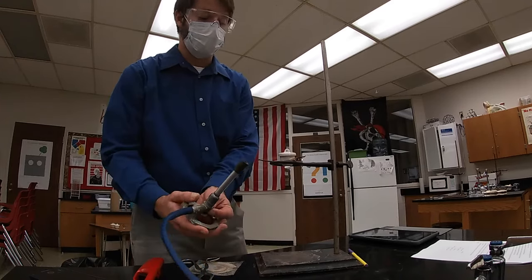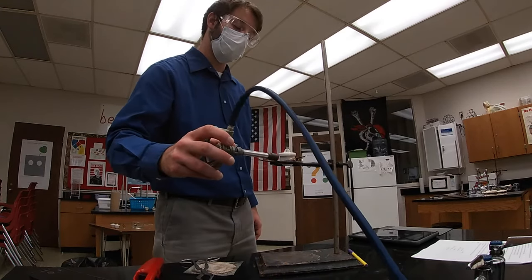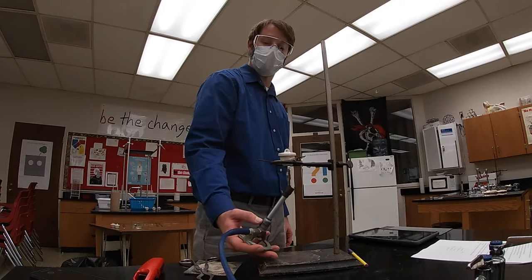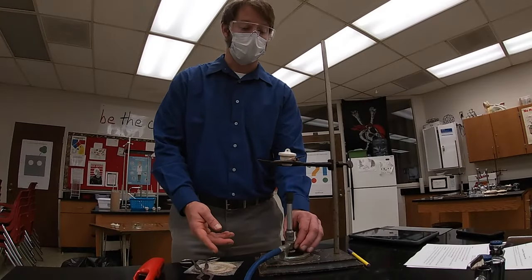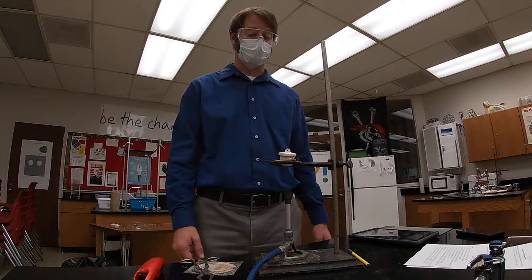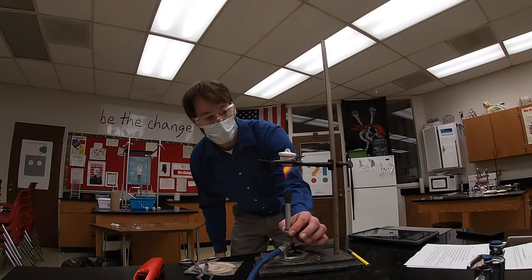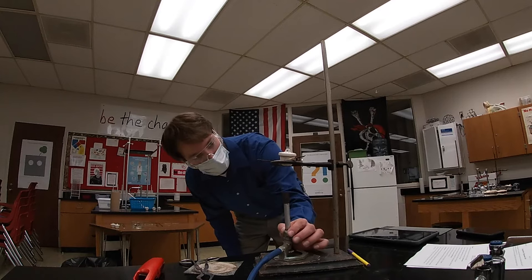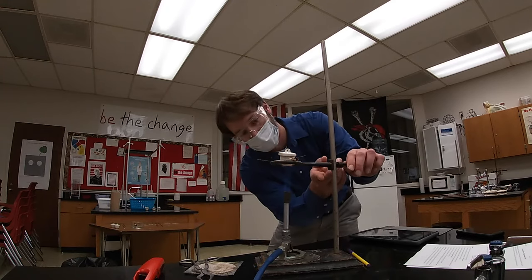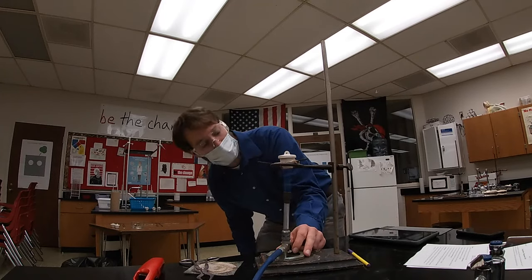Now I can hold the burner by the base and paint the crucible, heating all portions of it. I don't want to heat it vigorously — I'm just trying to make sure I'm driving off any of the water. Now that I've painted my crucible with a medium flame for two to three minutes, I'm ready to heat this crucible as hot as I can get it. I'm going to adjust my burner to get a nice inner blue cone and increase the flame size so the tip of the inner blue cone is just licking the bottom of the crucible. I'm going to lower my ring a little bit so that I'm vigorously heating my crucible.